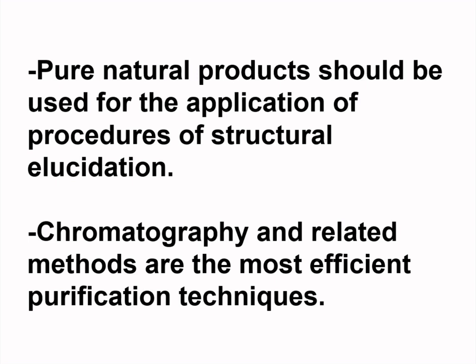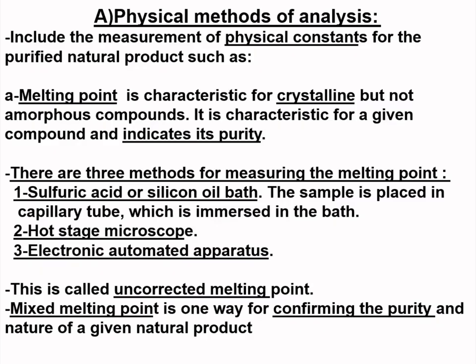These pure compounds can be obtained by chromatography and related techniques. The first step towards identification of a natural product is to measure physical constants, which include melting point, refractive index, and optical rotation.